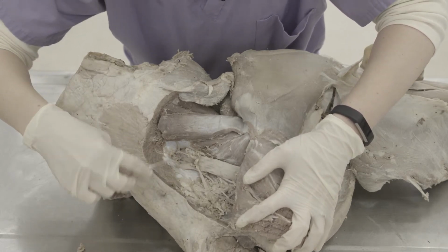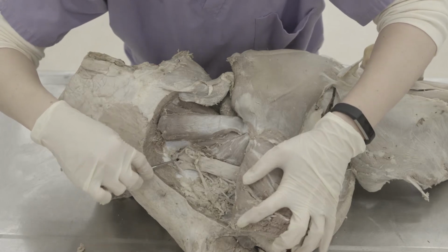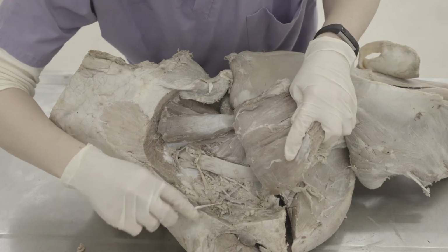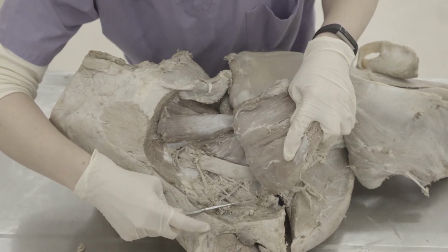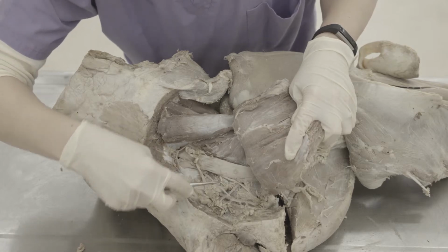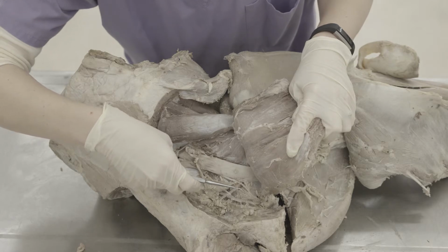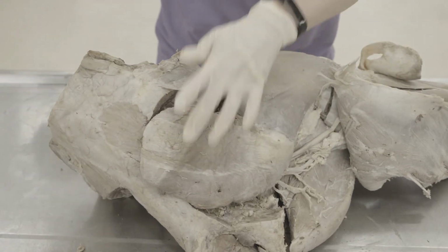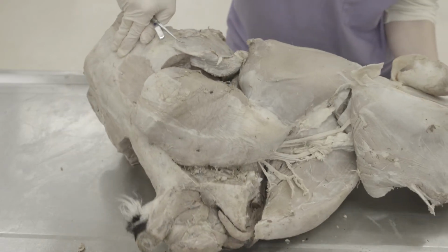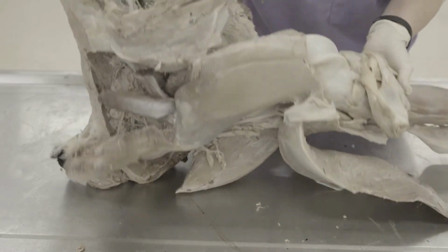And then also in this region, you can see on the right side your cranial gluteal artery is coming out here as well. Then you can find the continuation of what would be your caudal gluteal artery here and that internal pudendal. So here's that branching point into caudal gluteal and internal pudendal on the right side. The other nerve that you can look for is the femoral nerve on this side. I'm going to flip this over towards you.